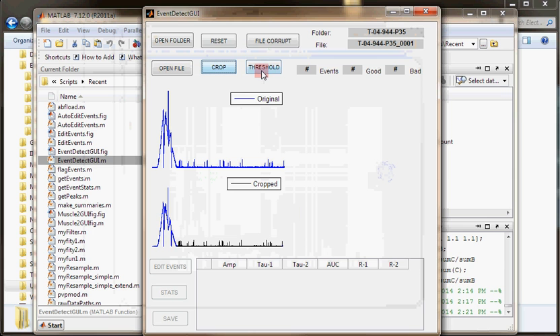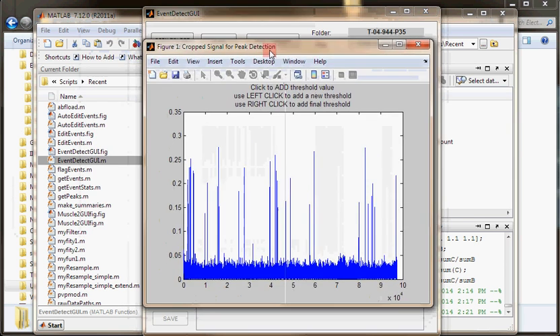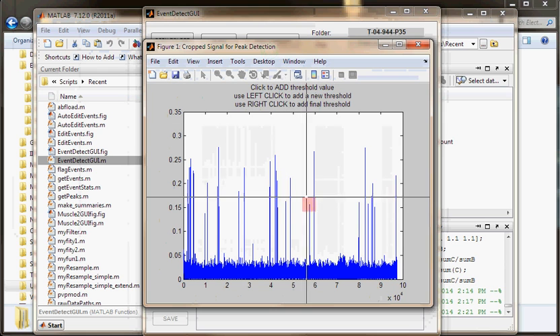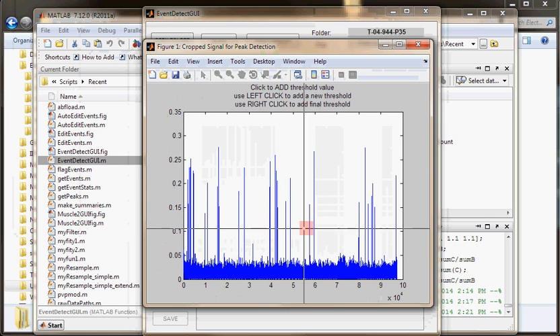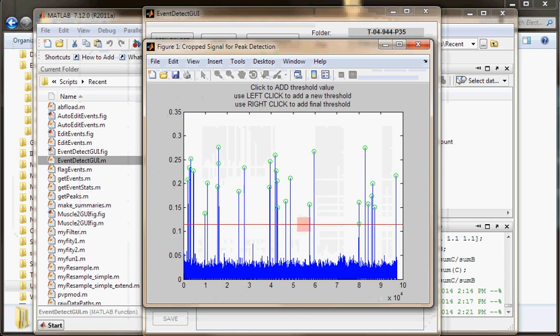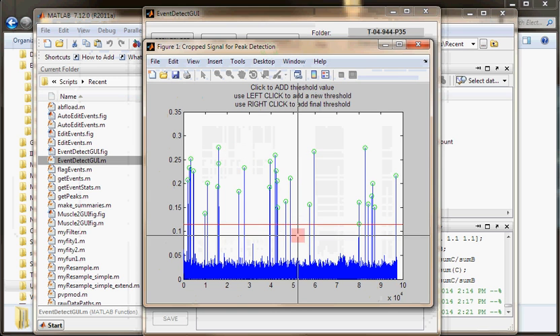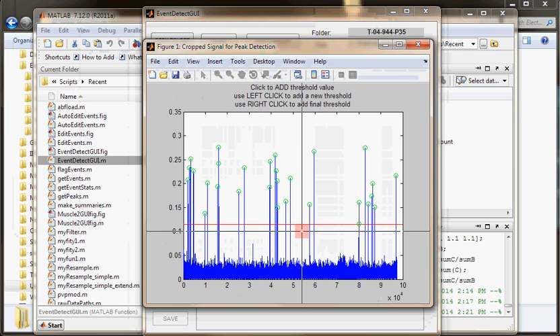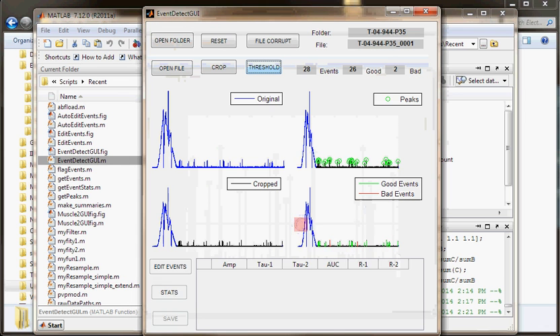The second thing I would want to do is apply a threshold value. If I click threshold, I should get another window. Once again, just like crop, I can left-click to add a value, and it'll give me the peaks it's interested in. That looks like a good level, so I'm going to keep it there. Then I right-click to end my peak selecting.